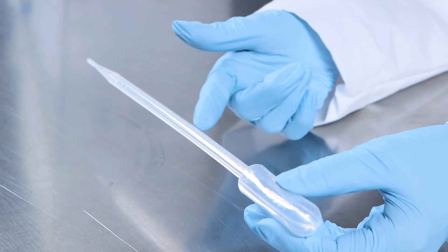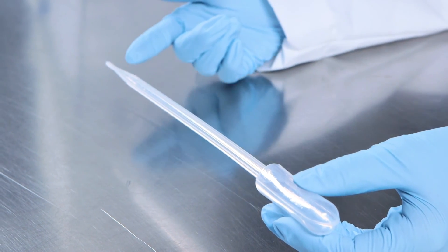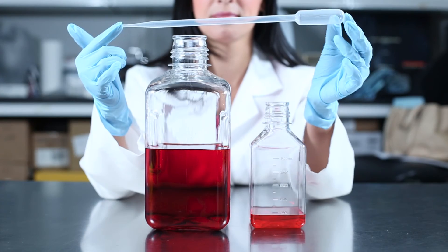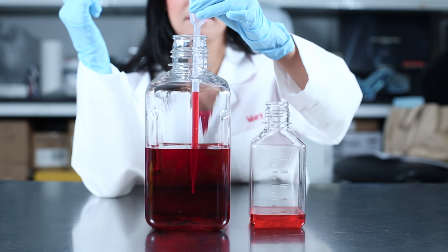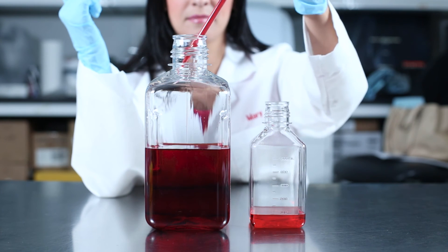Samco Extra Long Transfer Pipettes range from 6 to 12 inches in length. Extra Long Transfer Pipettes are ideal for pipetting from a tall bottle or for transferring large quantities of liquid. The bore size is a standard eighth of an inch.